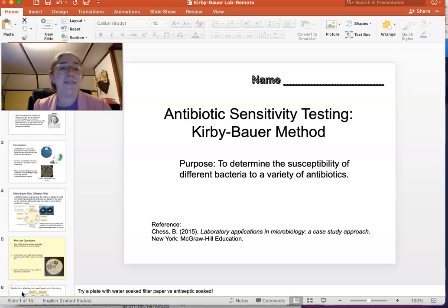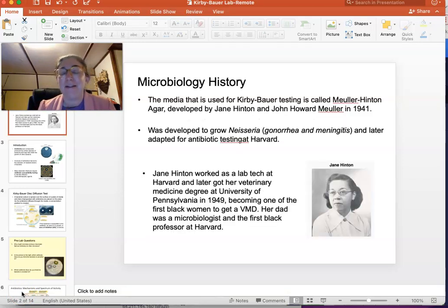Hi everyone, and welcome to the Antibiotic Sensitivity Testing Lab, also known as the Kirby Bauer technique. Start off with just a quick scientist spotlight.